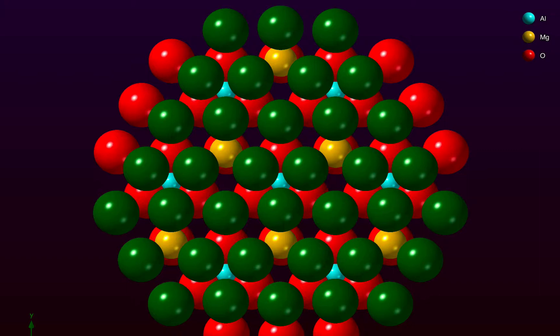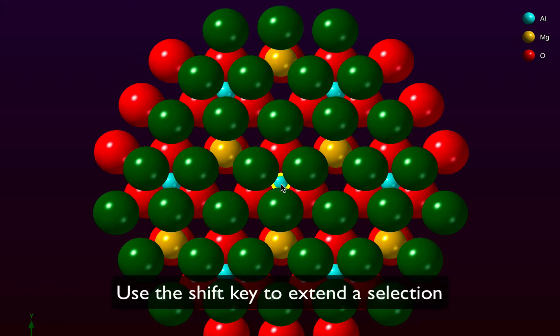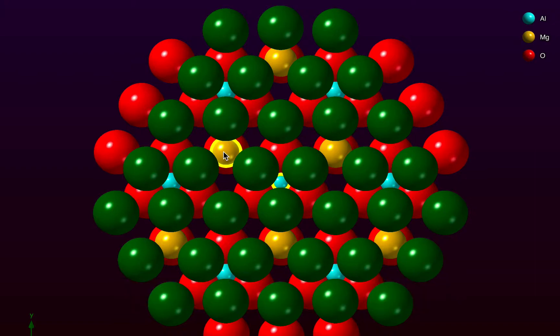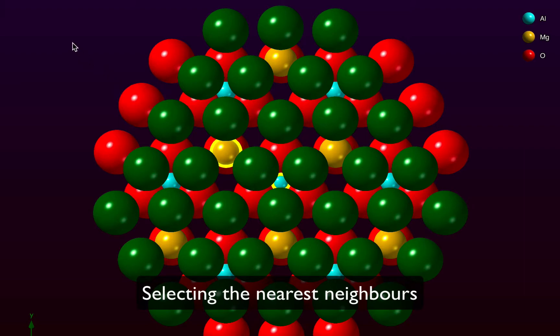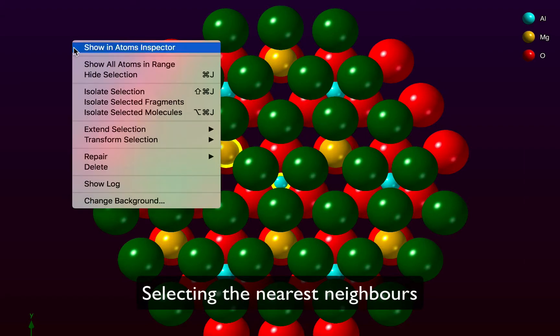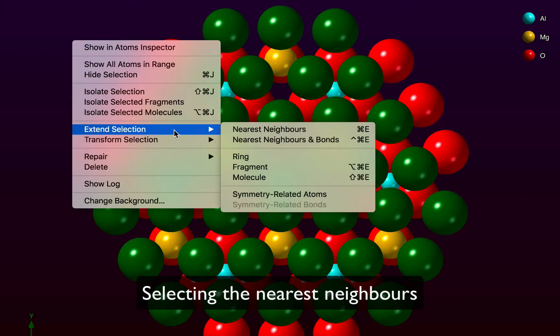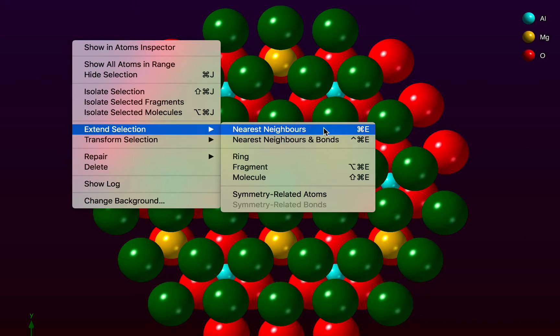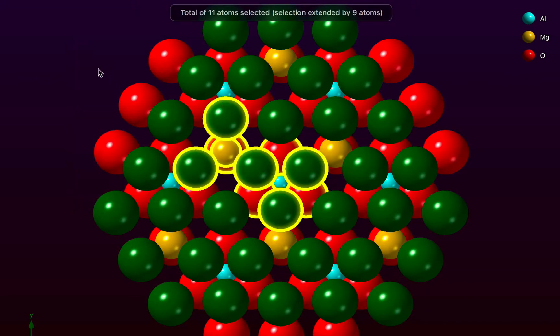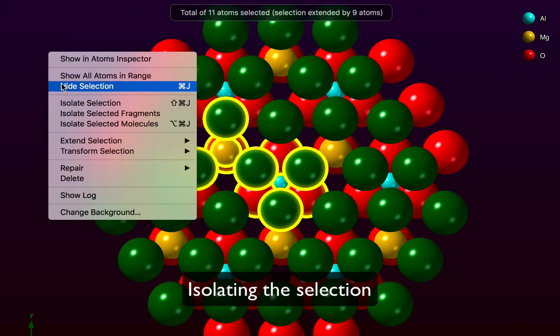So what I can do here is click on one of the aluminium atoms and then hold the shift key down and click on a magnesium atom. I want to select their nearest neighbours and I can do that by right clicking and telling the program to extend the selection to the nearest neighbours and now we can isolate that selection.